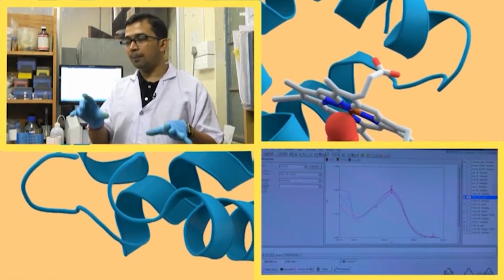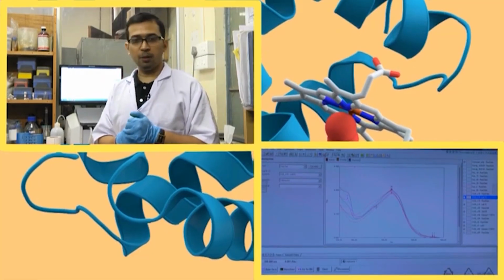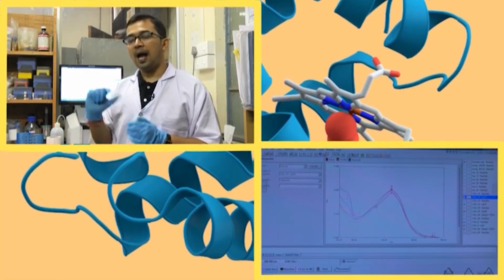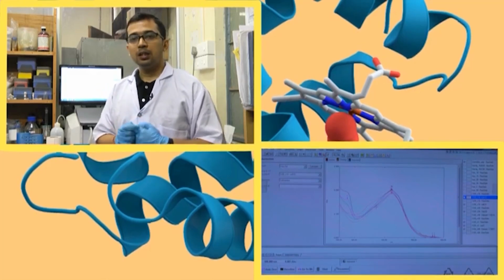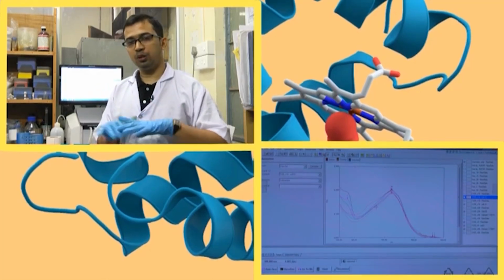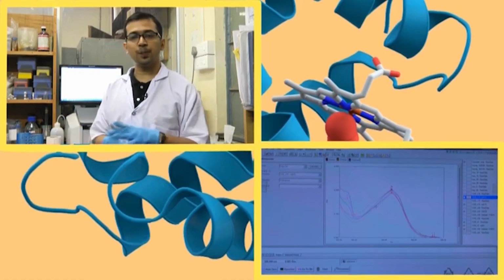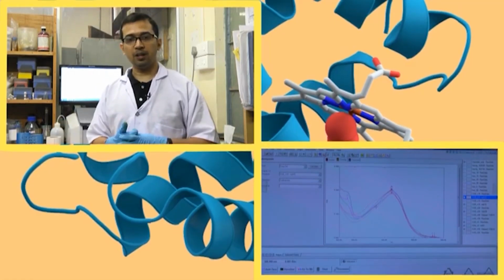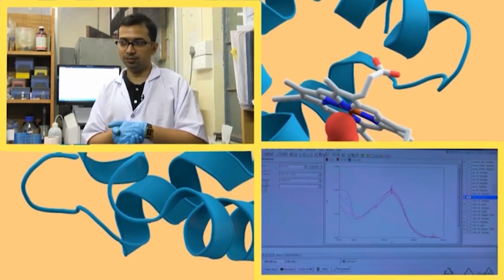So, out here what is happening, the curcumin is settling down at the bottom. Okay. Now, when you are adding HSA, what is happening? Your HSA is combining with curcumin. It is well reported that HSA combines with curcumin. You can find the HSA curcumin interaction paper online, it is available. HSA is combining with curcumin, forming an HSA curcumin complex.